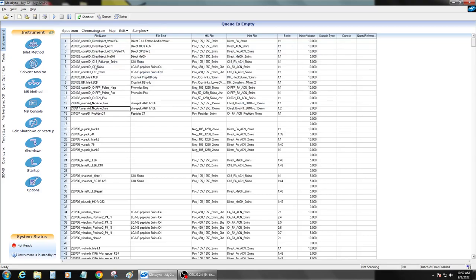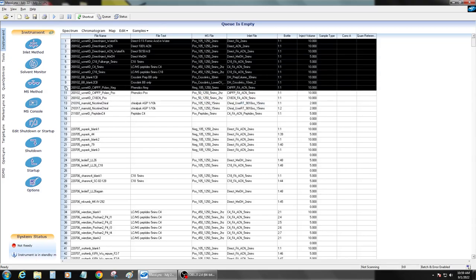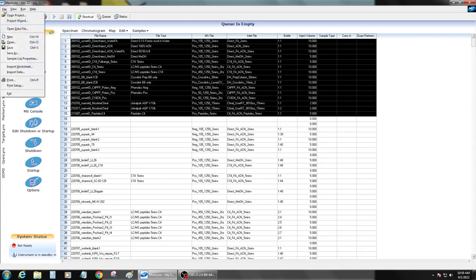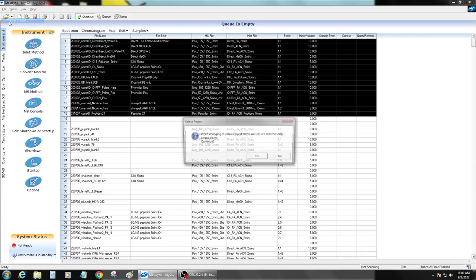There are direct injection methods, CHC-4 methods, and a bunch of custom methods for people. Copy that. And I'm going to go ahead and use the project wizard.